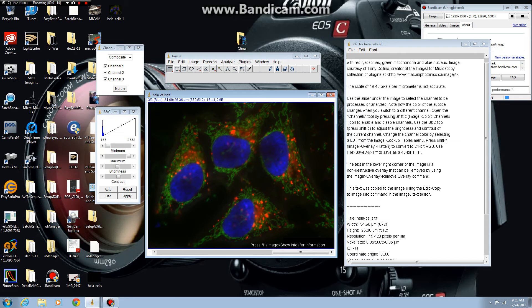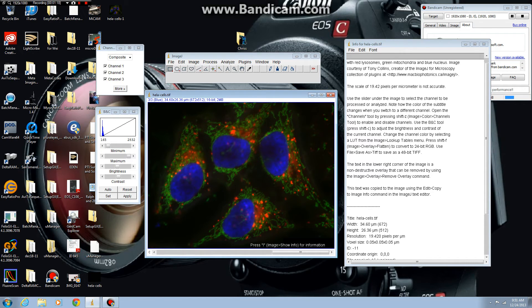Once it's an RGB 24 or RGB 48 TIFF, it can then be saved and be opened by Microsoft products. I'll demonstrate this example.